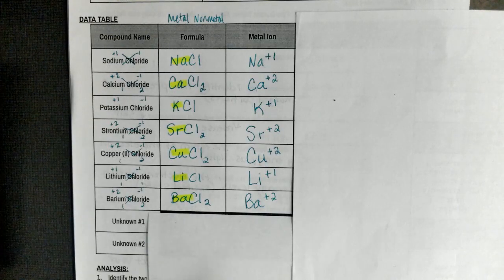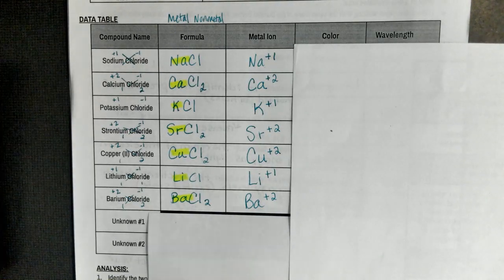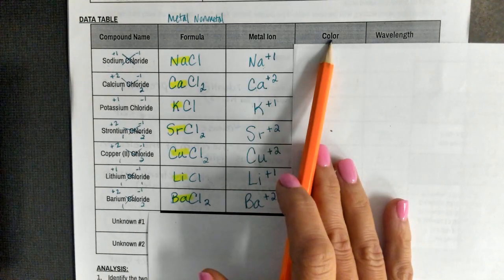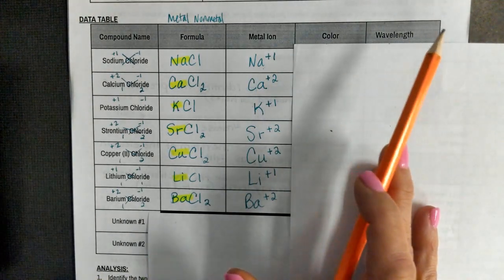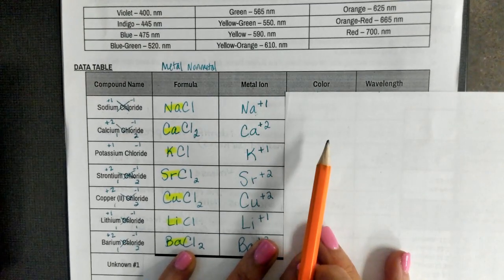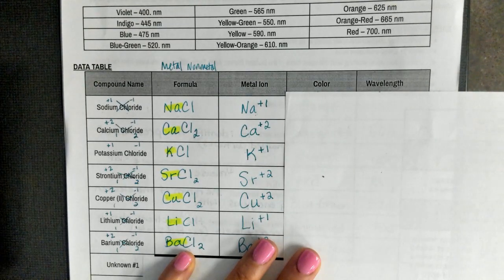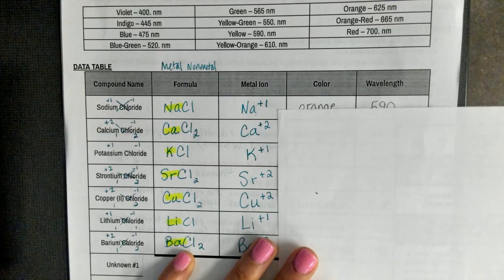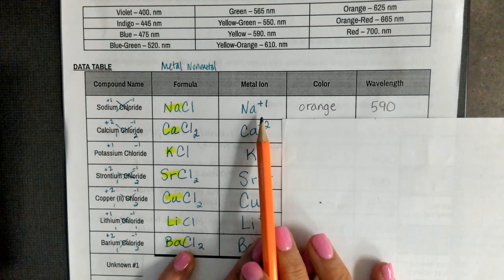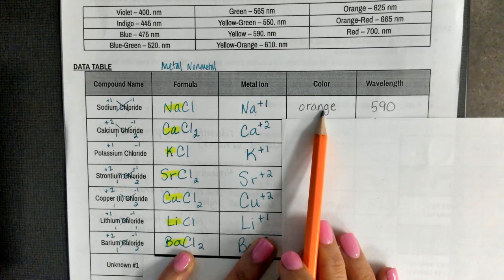All right, ladies and gentlemen, so you should have this much filled out. In lab, you are going to be figuring out what the color is for each of these metal ions, in addition to what the wavelength should be, so that you can figure out your color from the video. I'm just going to show you the first example just so you get an idea of what you're going to be doing. But if I watch the video, it's going to show me that sodium has an orange flame.